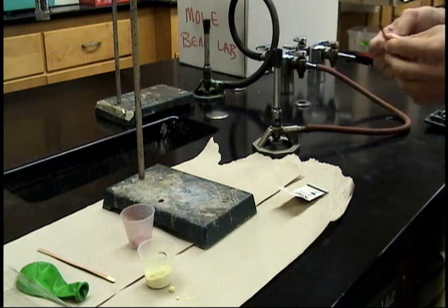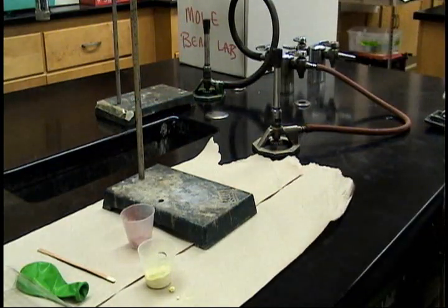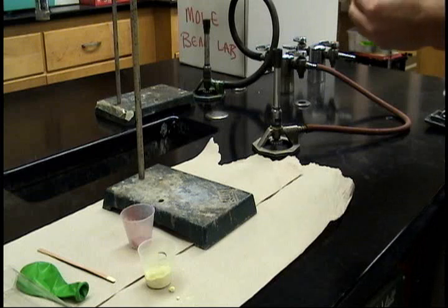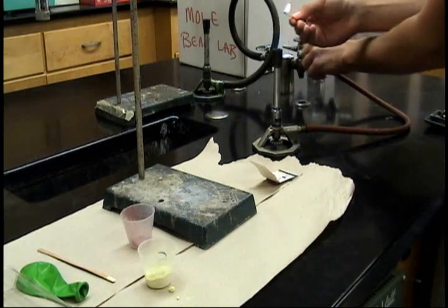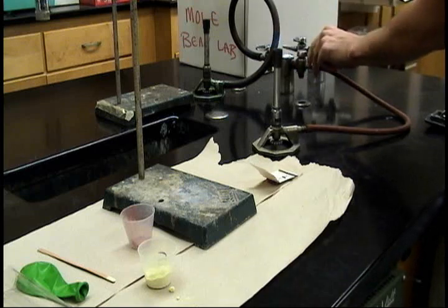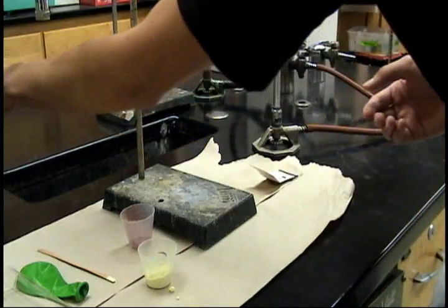That wasn't cool. I'll try that again. This time we will let the air out of the tube. Light the match and put it away in a bit of water.